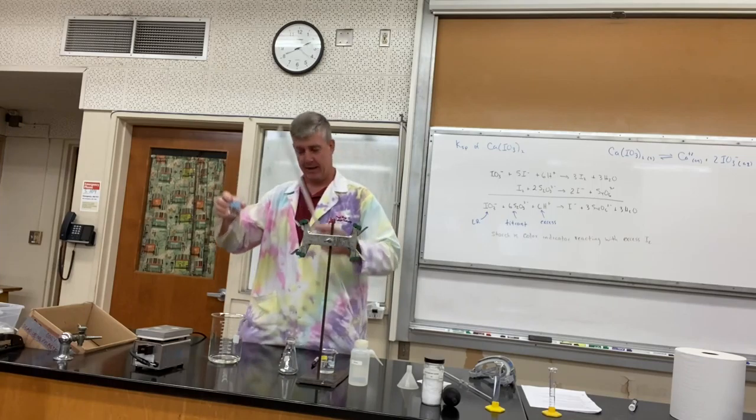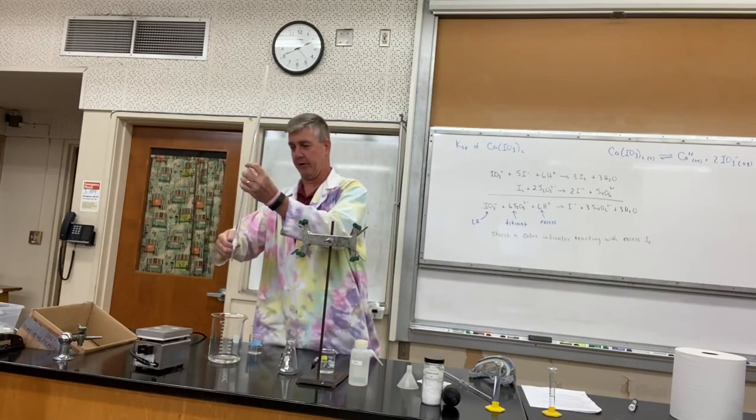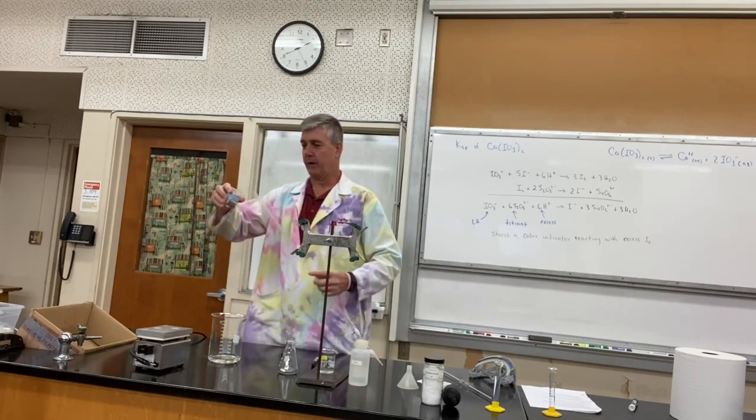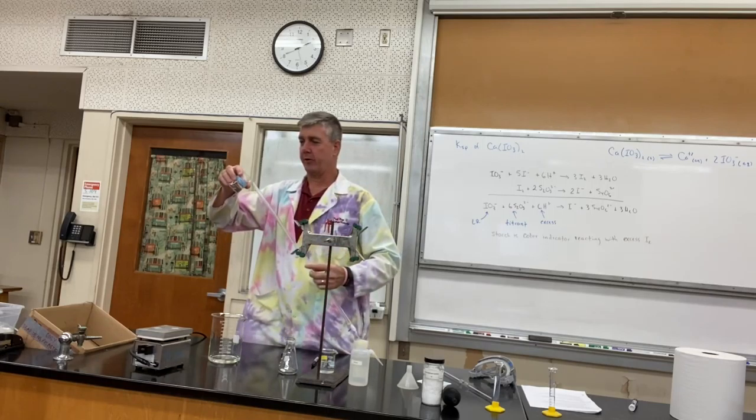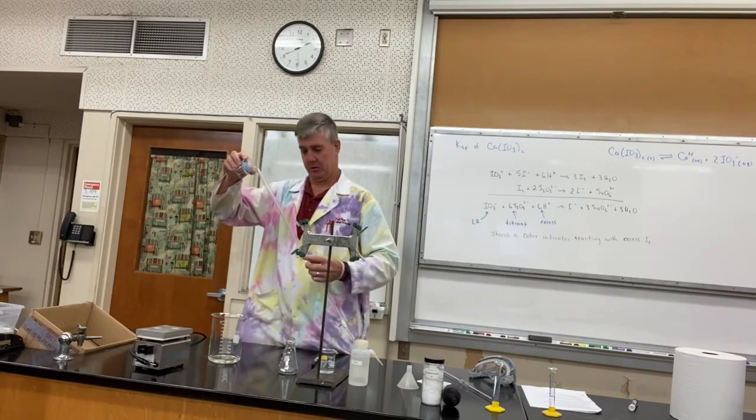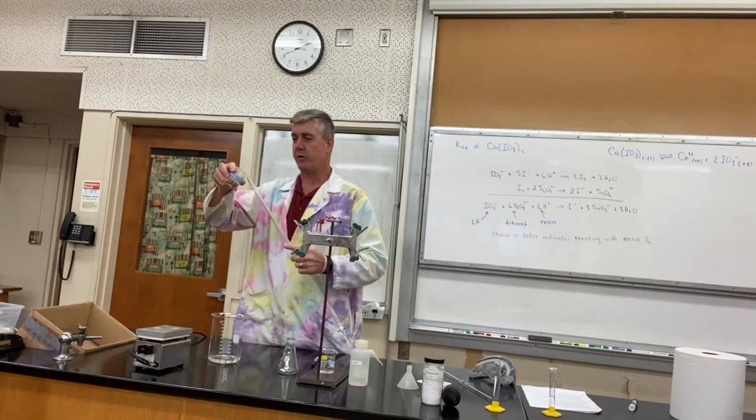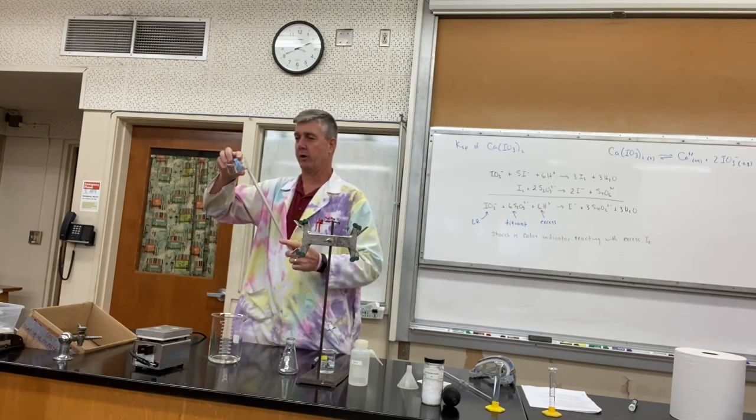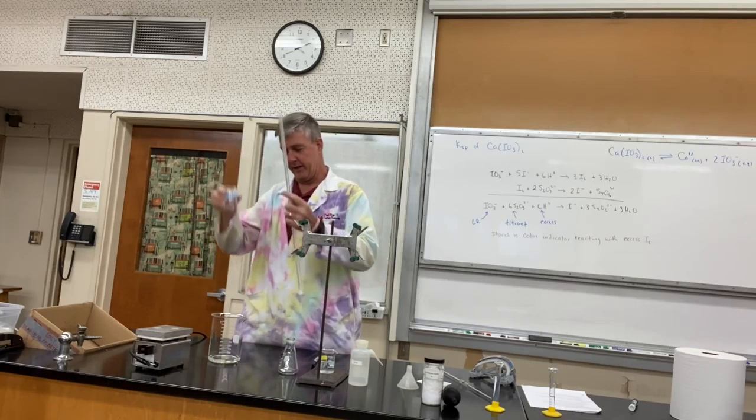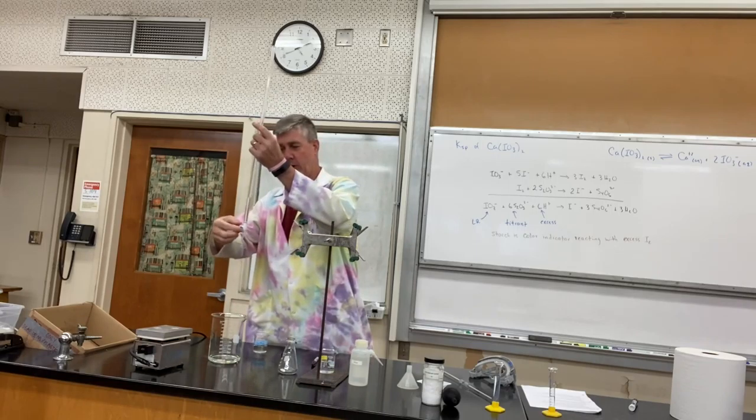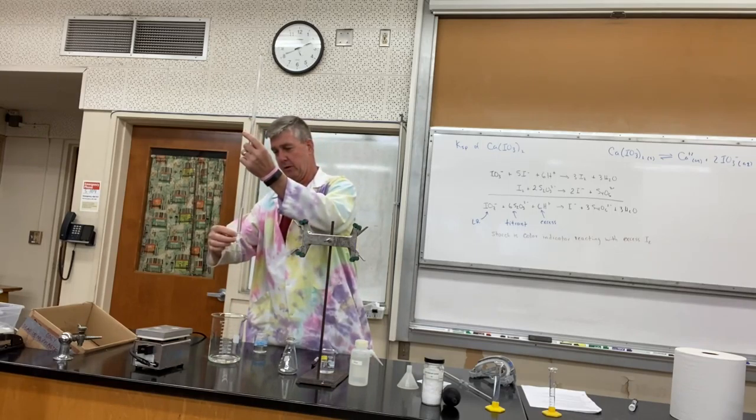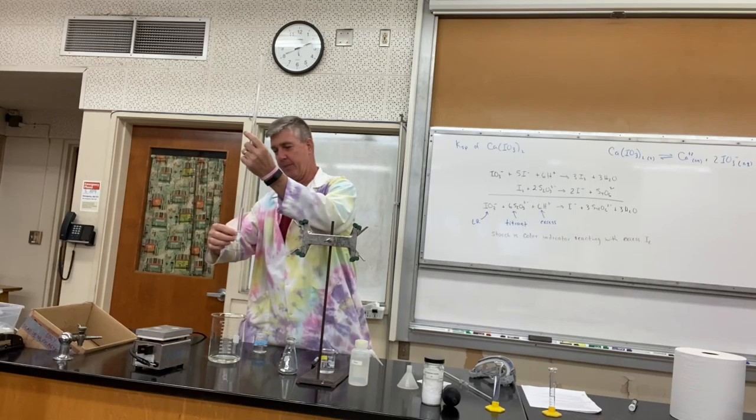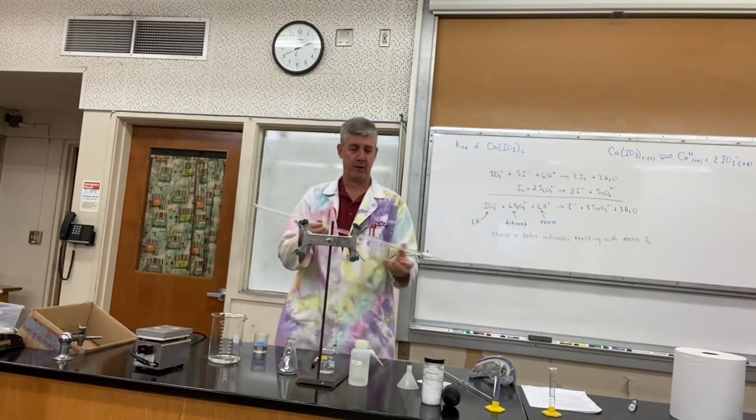We're going to be using thiosulfate as our titrant. So one of the first things you want to do is condition your burette. I have a funnel that does not fit, but that's okay. When conditioning our burette, make sure the stopcock is closed.